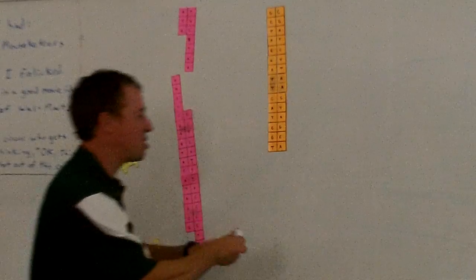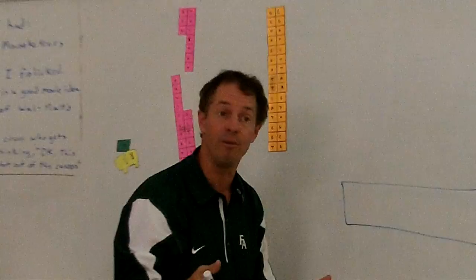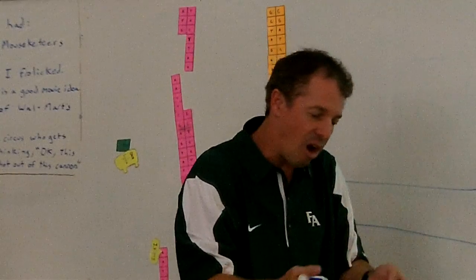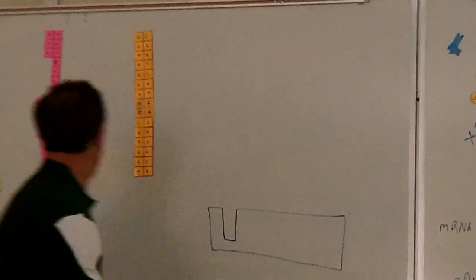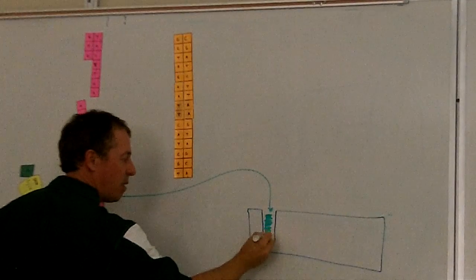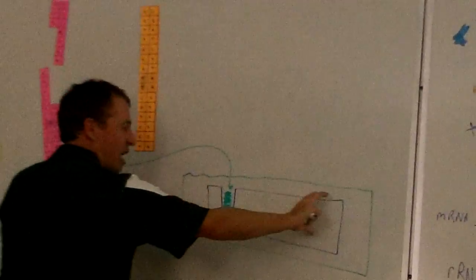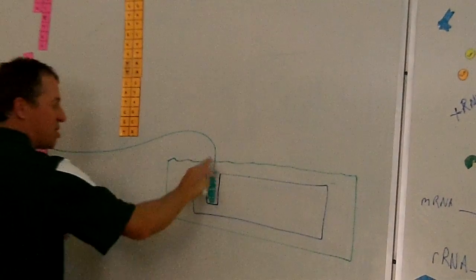Then we take the pieces and we put them into a gel. And what we do, we'll do this in the lab, you pour a gel, it's like Jell-O, you pour it into a box like that, and then it hardens, as it cools it hardens, and you cut a little well into it. And you pour the DNA, this DNA here, you put it in the well, you squirt it in there with a pipette, and it fills up the well. And then you take this thing, and you can see it's hooked up to an electrical supply up there. You actually submerge this thing in a fluid. You have a box that contains a fluid, and so the gel is sitting in your fluid. It's called electrophoresis buffer, this fluid.